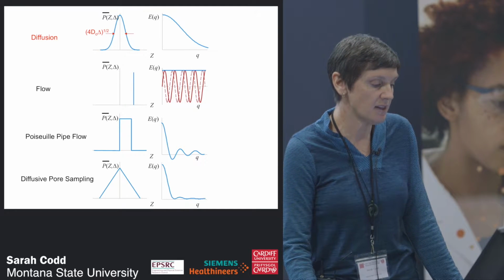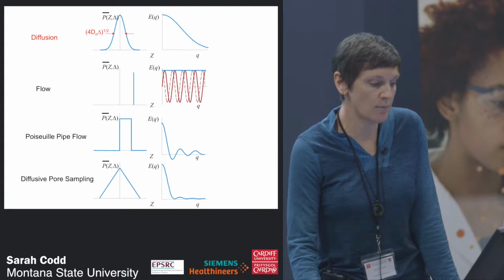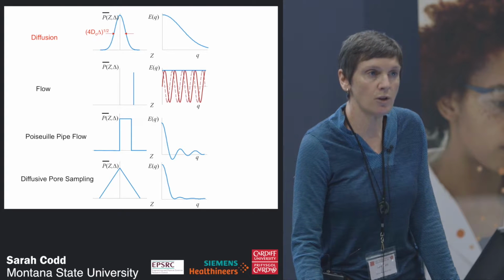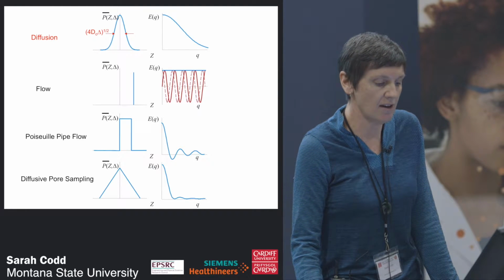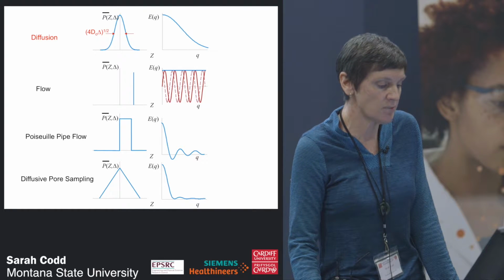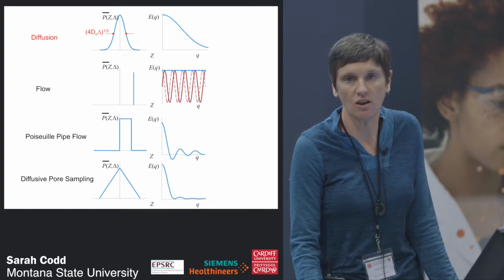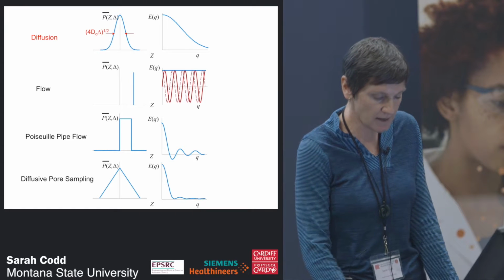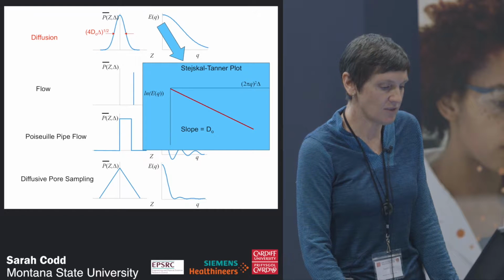And of course, a lot of work at that time was, and is still being done now, the idea that if you allow a long enough observation time in your experimental data, then the molecules are able to sample the entire porous media, and you get diffraction minimums, diffraction features that are a function of the pore space that things are diffusing in. So just flick through these.